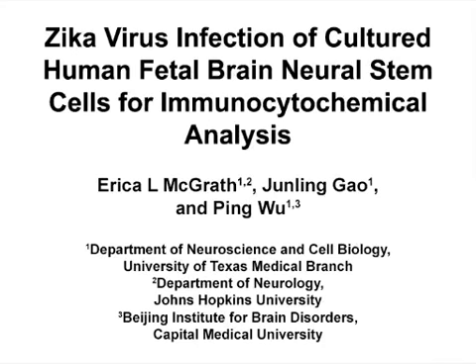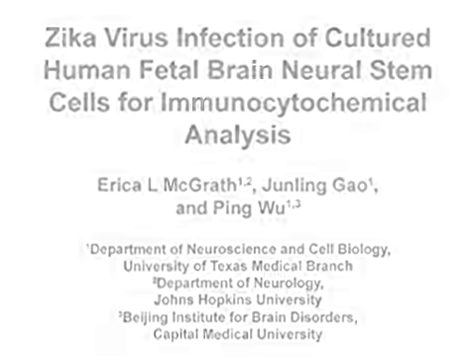The overall goal of this in vitro procedure is to observe the effect of Zika virus infection on survival and differentiation of human fetal neural stem cells. This method can help answer key questions in the neural stem cell and infectious disease fields, such as how viral infection influences innate immune responses and how these changes contribute to the survival and differentiation of neural stem cells.